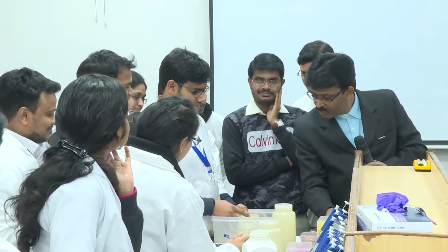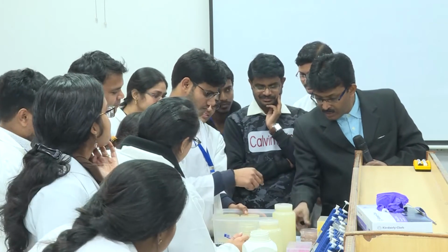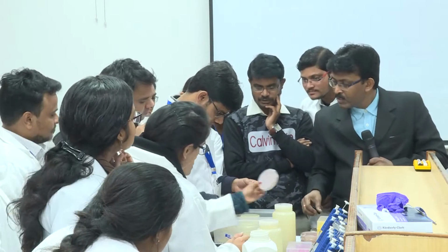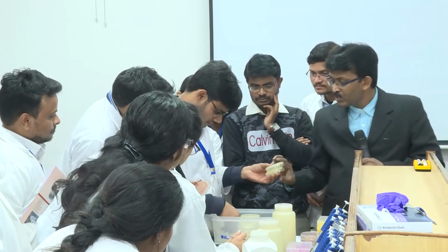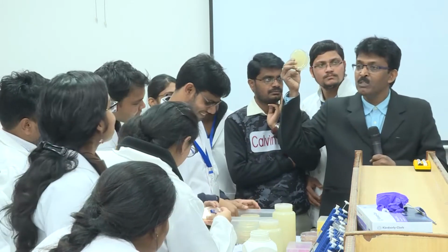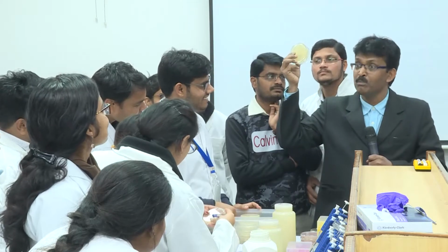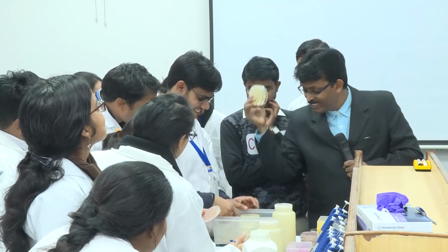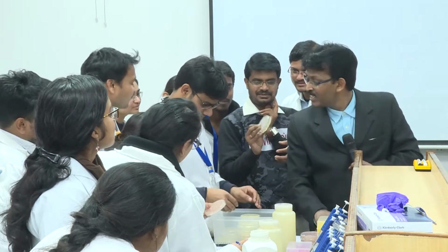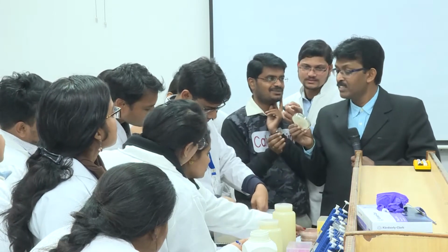So any other colonies? This is our first group. Others, the second is pure. Nothing is there. Here some bacteria. If nothing is there, I really appreciate them, and you could do the microbiology experiment without contamination. That's really beautiful. This is the third group.